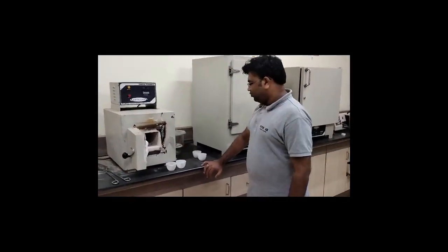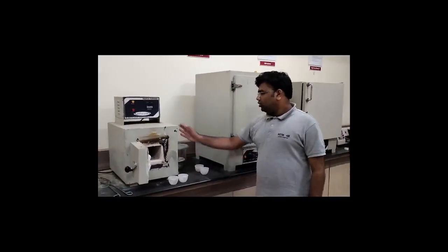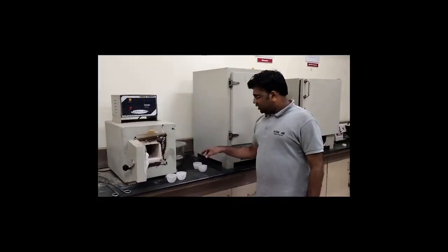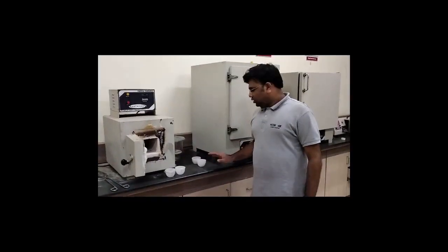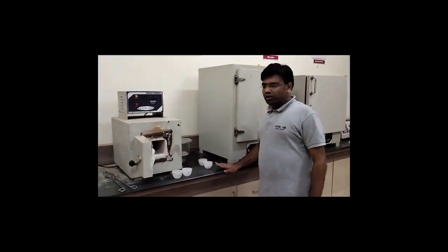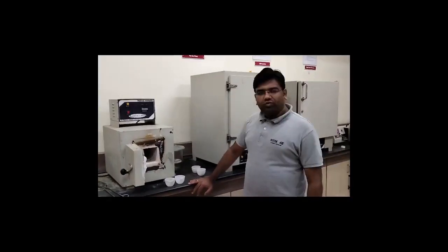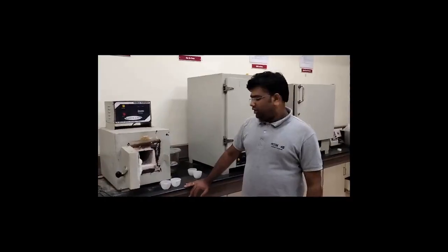Okay, so we have completed our first process. What we have done is we have removed the crucibles A and B. I've kept them in the same sequence. So this is our B crucible, this is our A crucible. It is yet to get cooled. Now in the meanwhile, we are going to keep our crucibles C and D, which are of TDS. Even for the TDS, we can find out what is the volatile content, or what is the fixed content in that total dissolved solid.